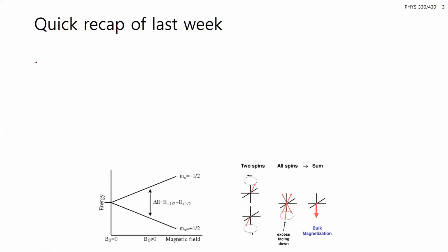talked about NMR, that we introduced NMR as an absorption process in the radio frequency range by nuclei in a magnetic field.